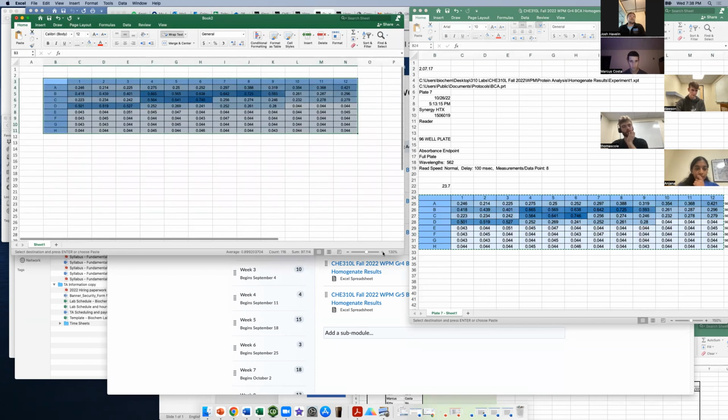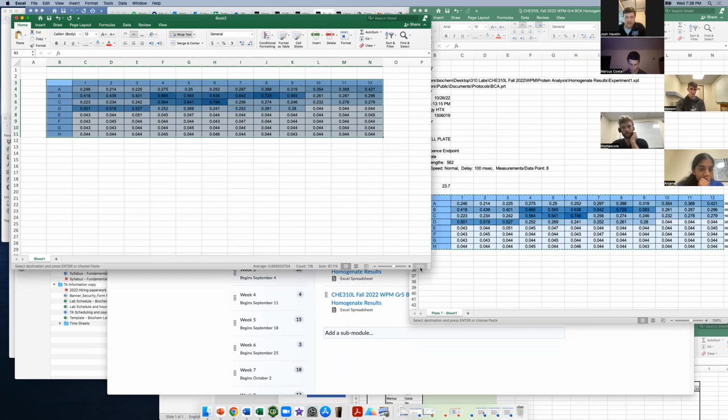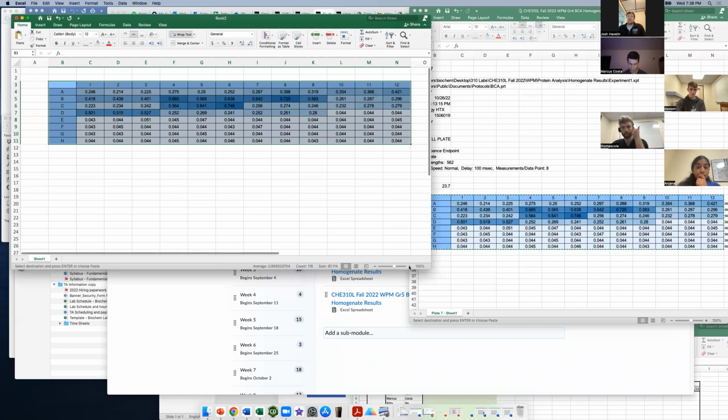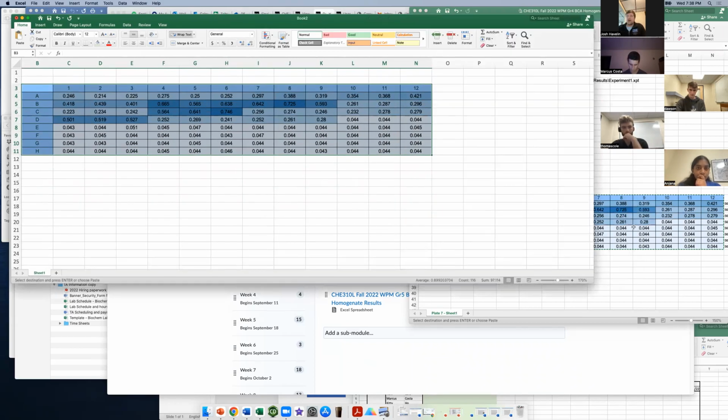Right, and I know, is this big enough for you guys to see? I know, like, when I share screens, it's tiny. It's still very tiny. Is everyone... That's good. Okay. Oh, it probably has to do with my monitor.